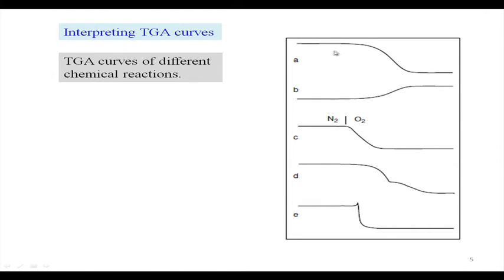You see, in all these we are only looking at two axes: one is the time or temperature axis, and the other is the mass loss axis. If we consider that the first one is for the mass loss, after some time at a particular temperature we have a monotonically decreasing mass, which stabilizes after some time and becomes horizontal at some point.